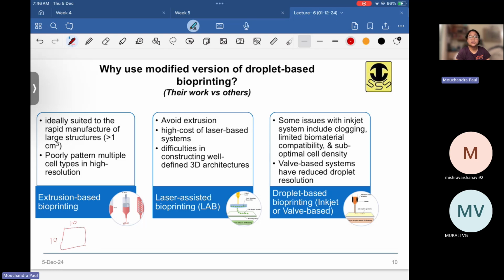The features do not become prominent. So that's why I usually start by testing structures which are at least 10 mm by 10 mm, or higher. If you go to 20 mm by 20 mm structures, those have obviously better resolution than the 10 mm by 10 mm ones.